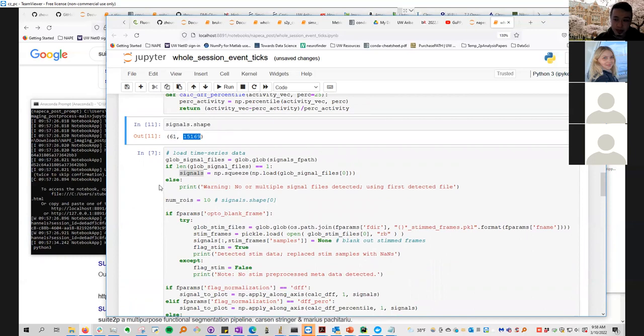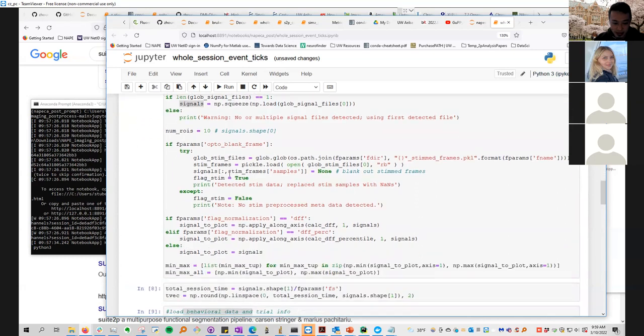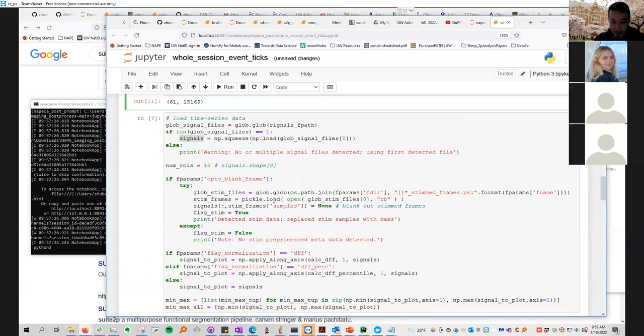So let's see, when do I want to show that? So Victoria, I'll work with you to adapt the Inscopix data, but shortly after this, I'll show people how to convert the Suite2P data to the appropriate format. And long-term, I need to update this code to automatically detect the file type that you're loading in and automatically adapt those data to this pipeline.